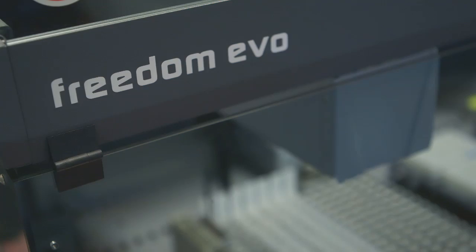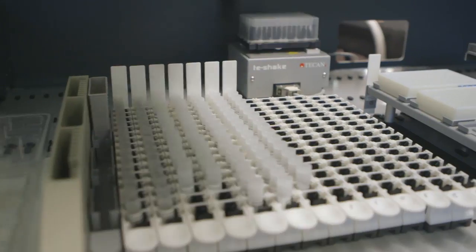You're currently in Monash Antibody Technologies Facility, which is an automated, high-throughput platform where we're able to deliver high-quality, high-affinity monoclonal antibodies.